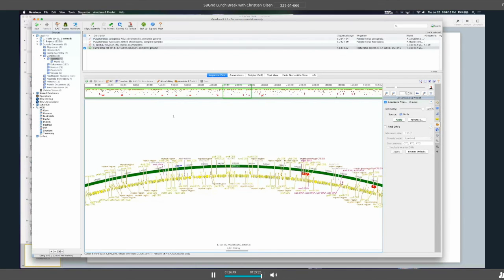Yeah, I think you could back it with something like GitLab or some Git-based system, so you could do it in GitHub, and you could push and pull from Geneious, which would be spectacular. Absolutely. Yeah, absolutely.